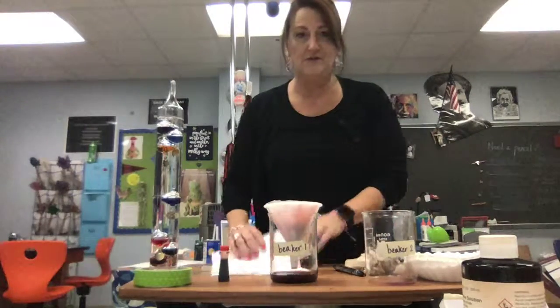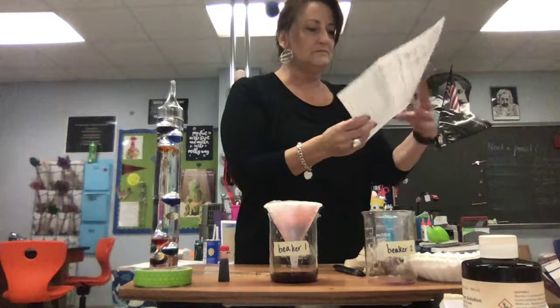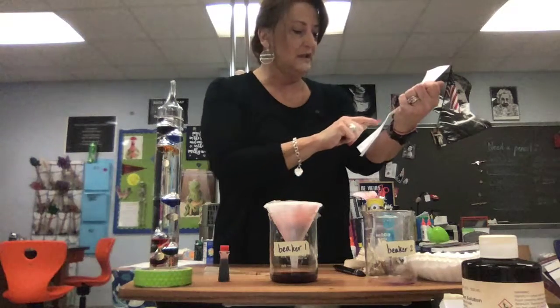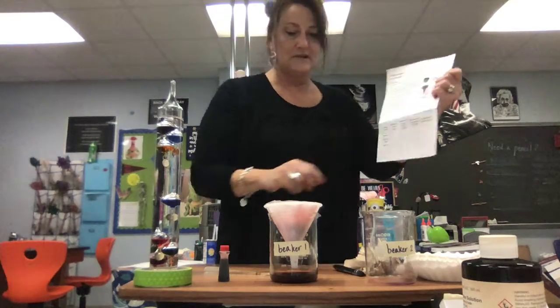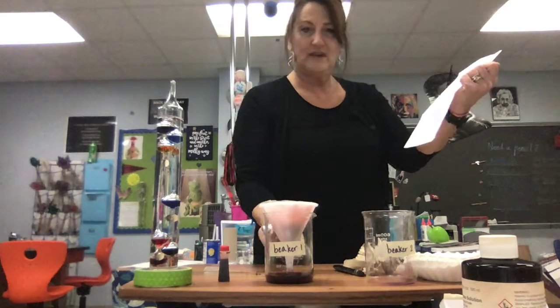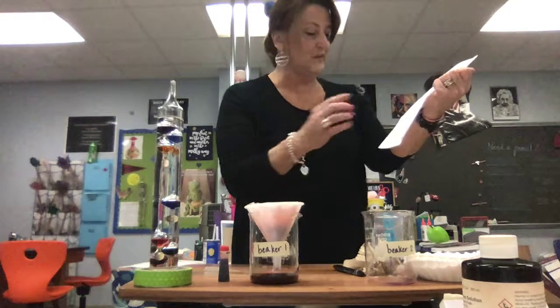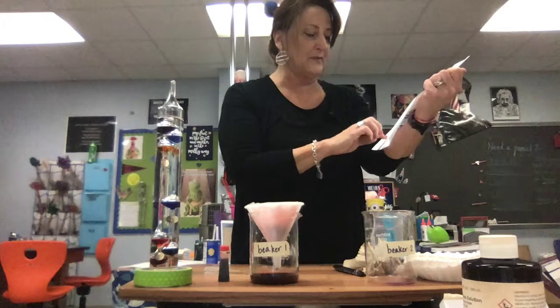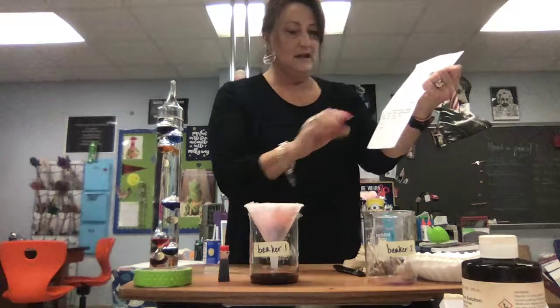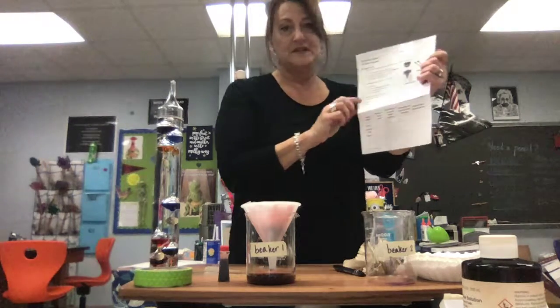Now you need to continue to fill out your data table. You need to fill out the first column, contents of urinary organs. So basically, what is in this thing, this urinary organ? First you have to figure out what it is. Beaker 1, coffee filter paper, beaker 2. So what is in it? And now remember, this was empty. Beaker 1 was empty. Observation of contents before filtration.